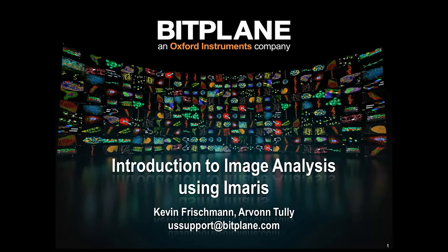And today we'll be walking you through an introduction of how to use Imaris in general for 3D image visualization and analysis. It's a bit different from earlier sessions in that we're trying to leave a significant portion of the webinar for a Q&A session.